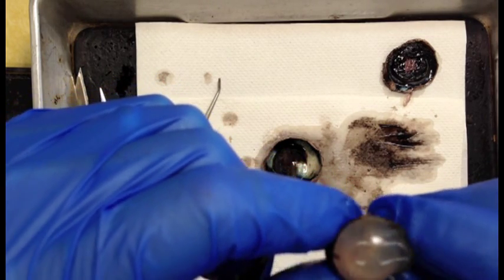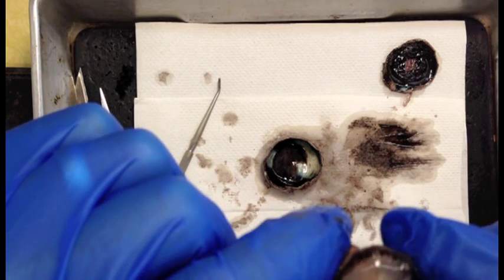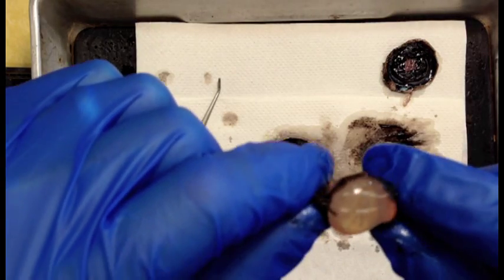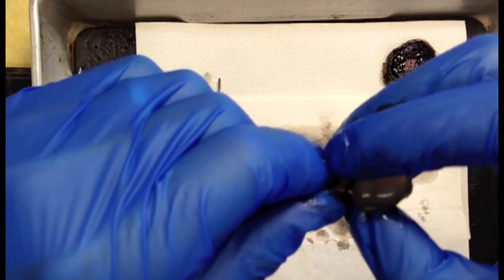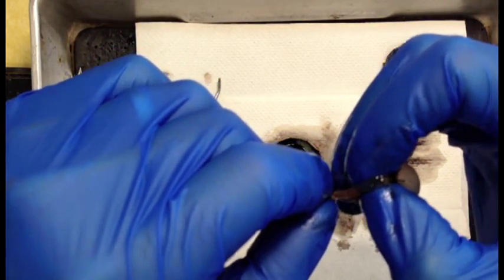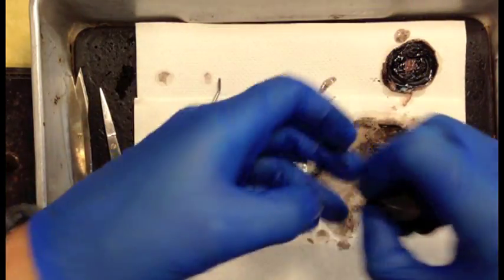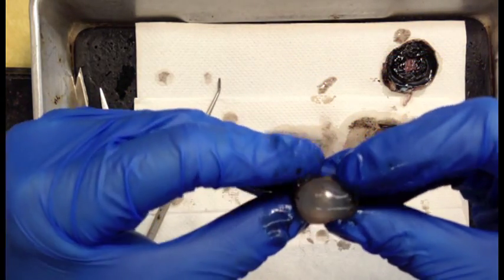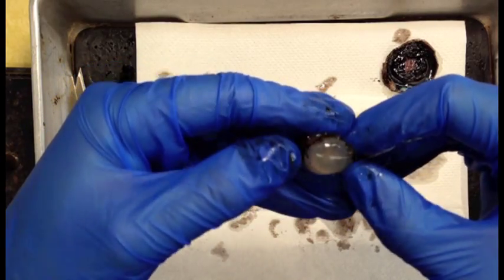It's a little opaque now, but when it was living, it was much clearer. And you can actually see through it, and you could see that everything appears upside down and backwards. And that's just how our eyes work. Right? Images that go through are upside down and backwards, and it's the brain that is able to flip this image so that we perceive things oriented correctly. And this also, it's just like how microscopes work. Images are upside down and backwards. So that's the lens there.